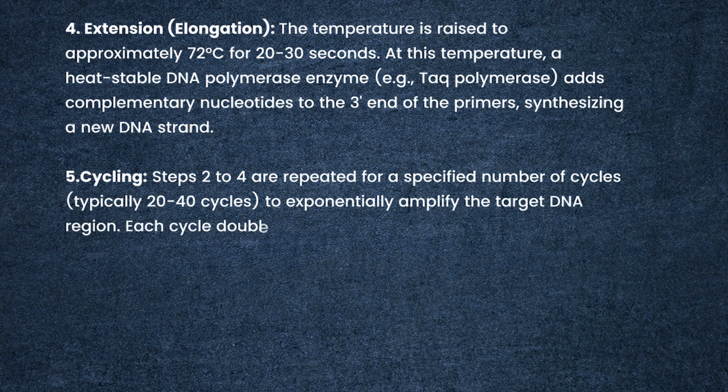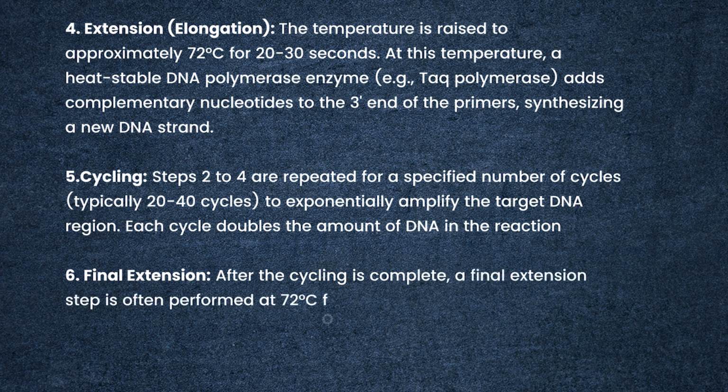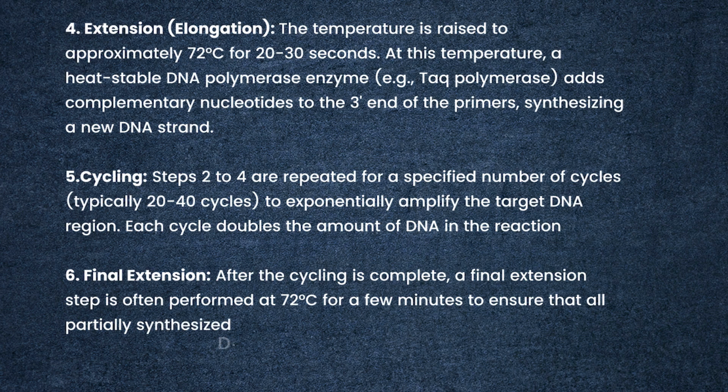Each cycle doubles the amount of DNA in that reaction. And finally, final extension, the last step. After the cycling is complete, a final extension step is often performed at 72 degrees centigrade for a few minutes to ensure that all partially synthesized DNA strands are fully extended.